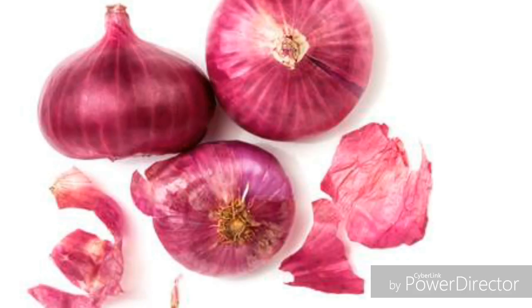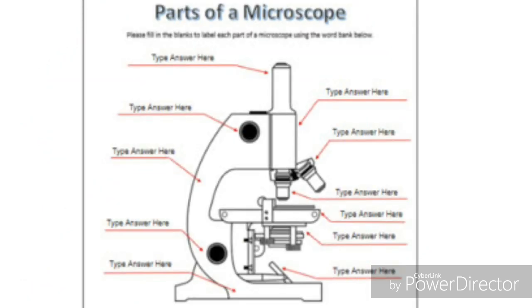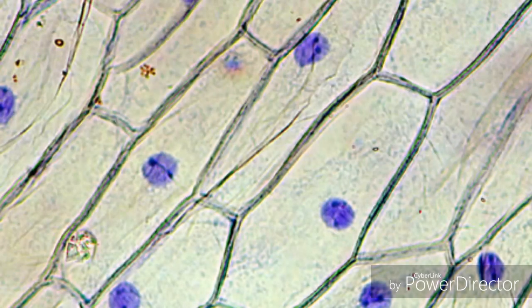Now in this experiment we are observing plant cells, and in that you have to identify mitochondria. Actually, mitochondria are extremely small. They can be seen clearly in an electron microscope, and their detailed structure can be studied with the help of an electron microscope. Here what we are observing is small red colored dots in the cells. You can just identify their presence in the onion peel cells.